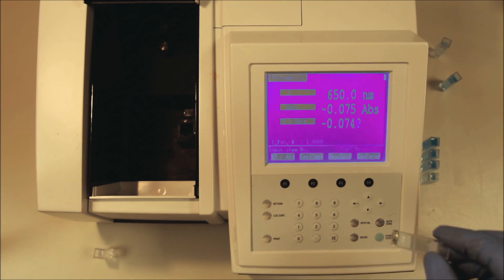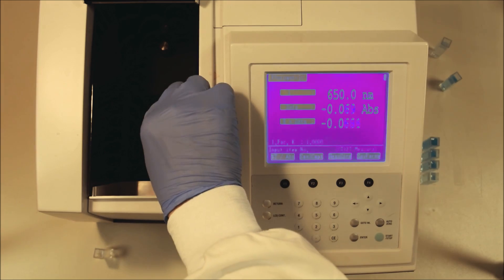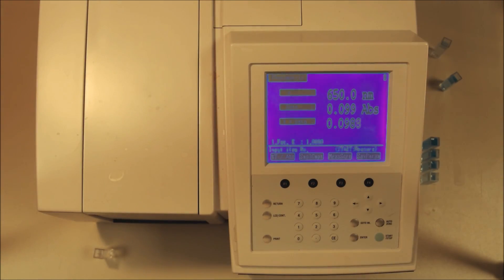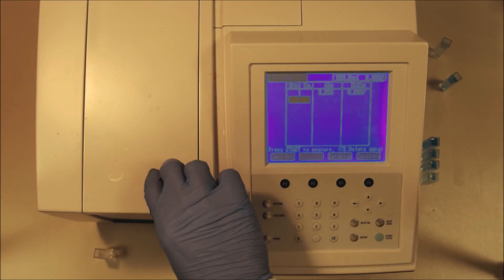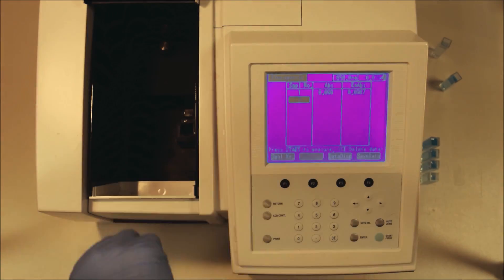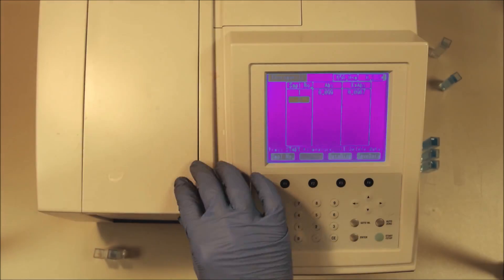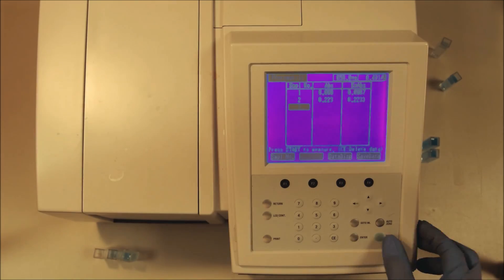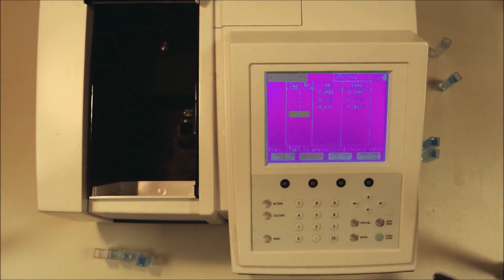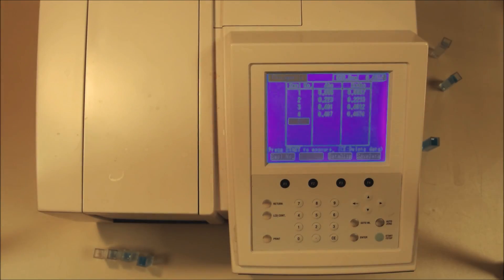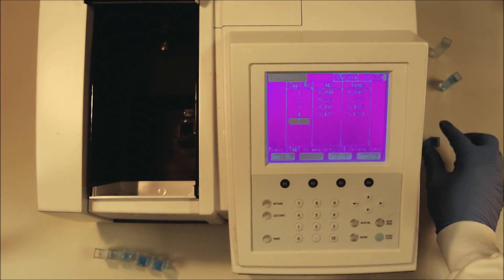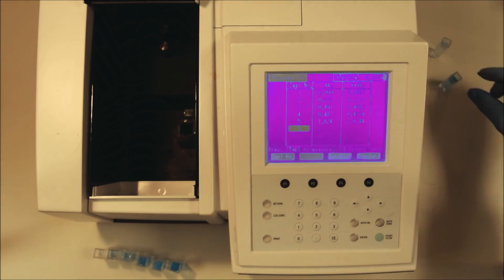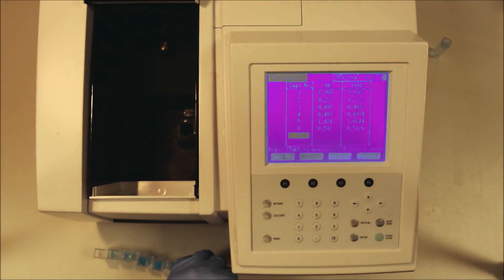Now we just take our samples in order, place them into the machine making sure to have the clear face pointing the right direction and then we push make measurement or in this case start stop. The machine will store the readings one at a time and we can make all our readings and then we're going to write those down. Once we've got all our measurements made we can take those and place them into a standard curve and then the last two samples which are the unknowns we can calculate the concentrations using our standard curve and the equation of our best fit line.